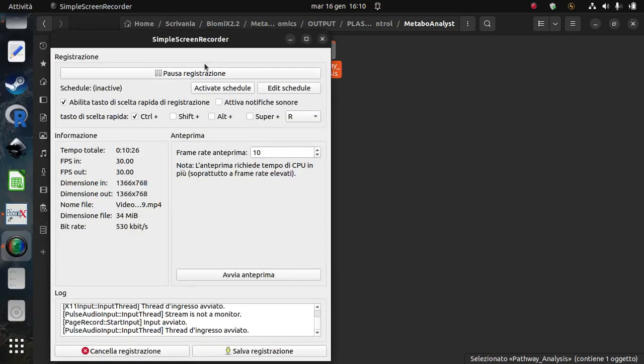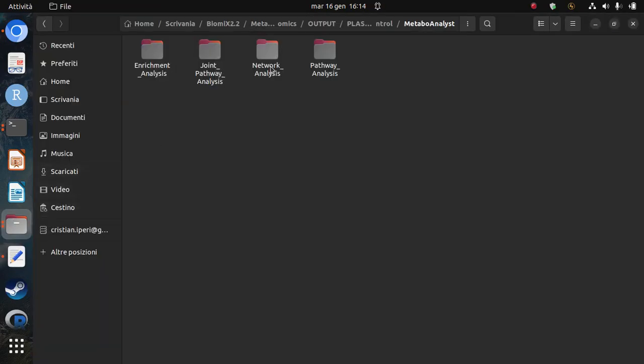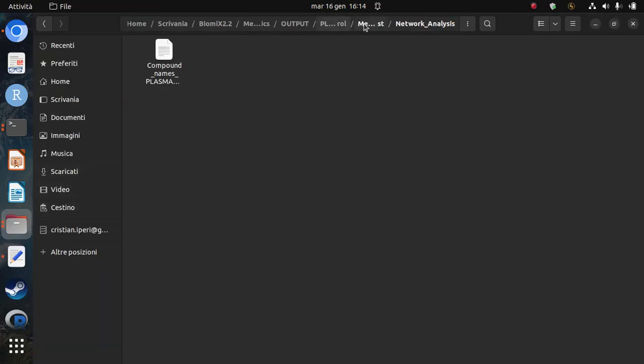Wait, I show you. So just to show you something that you can do, you can click, for instance, in network analysis here.